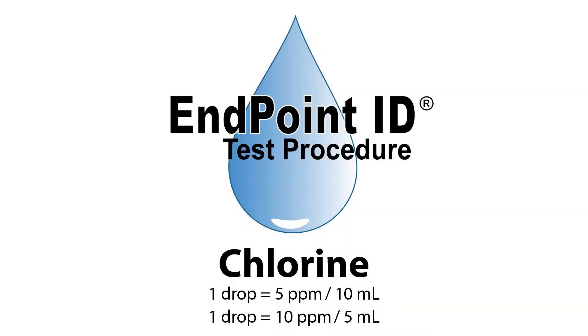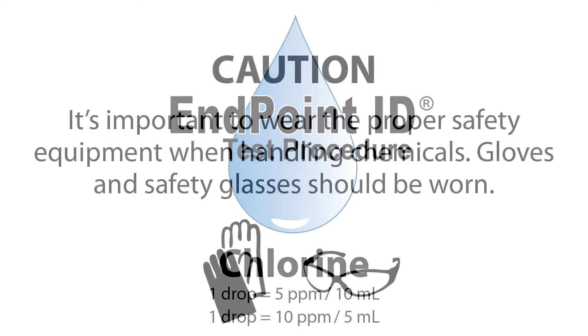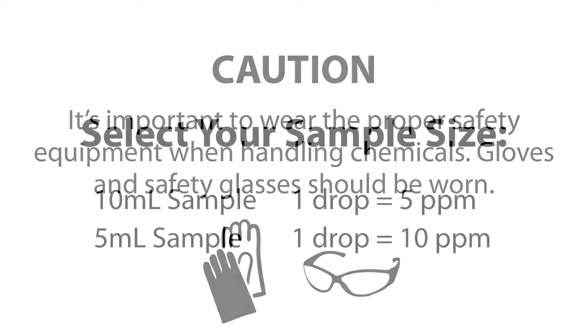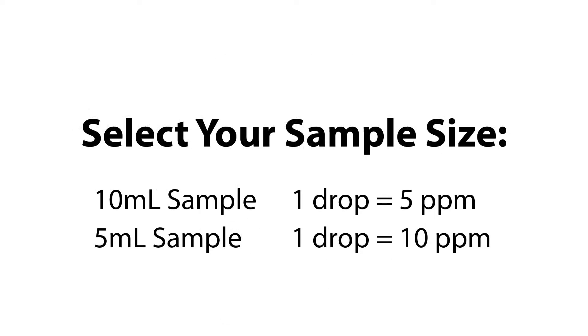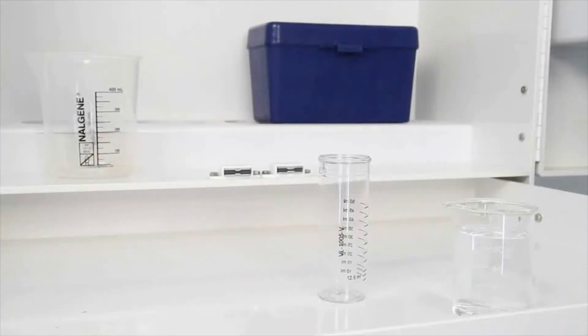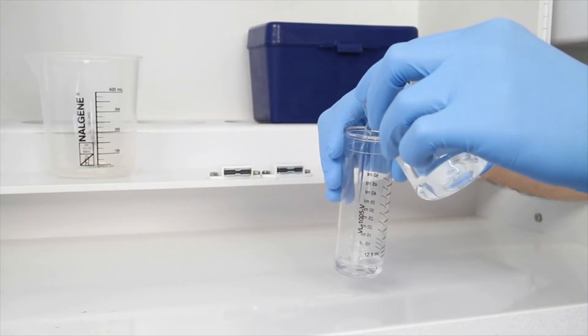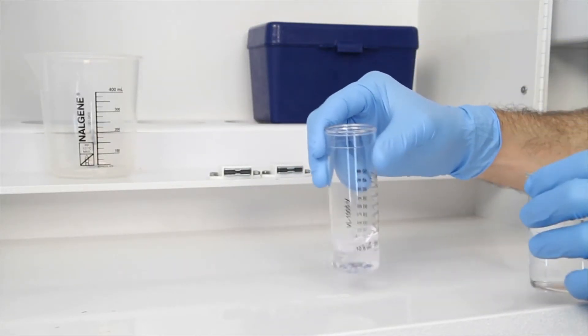This is a demonstration of the Chlorine Drop Count Test Kit using Endpoint ID procedures. The first step is to gather an accurate sample. The smallest change in sample size will lead to inaccurate results.